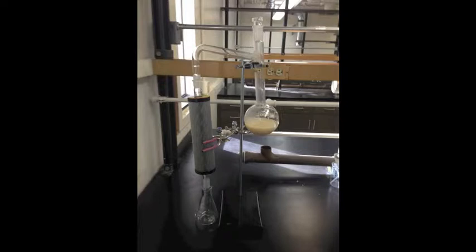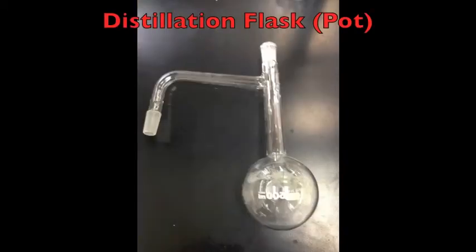Let's now transition to the setup of the distillation chamber. During this setup and throughout the experiment, we must keep in mind that we are working with very expensive equipment, so please use caution. It is good practice to reduce the moment arms associated with the distillation chamber to reduce the probability of tipping. First, we must prepare the distillation flask or pot by adding boiling chips.